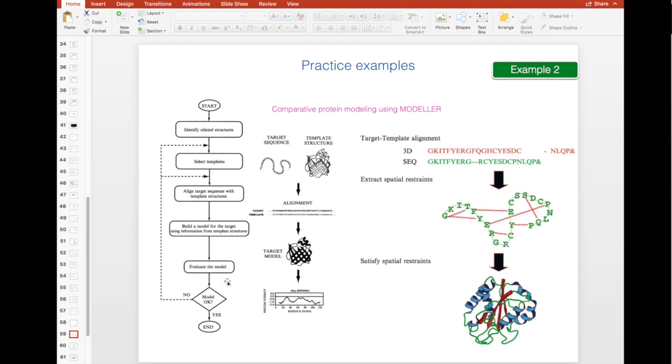This is the process here. If you are more curious how this looks like in detail, I refer you to the Modeller website.